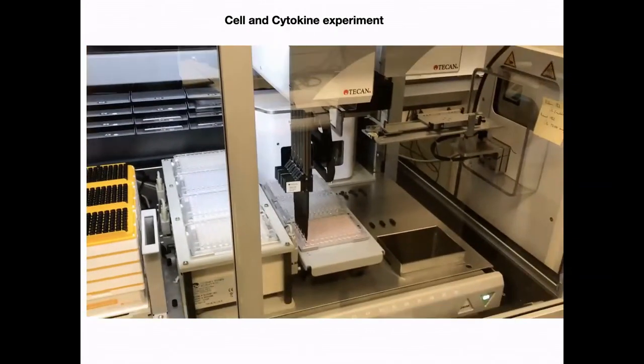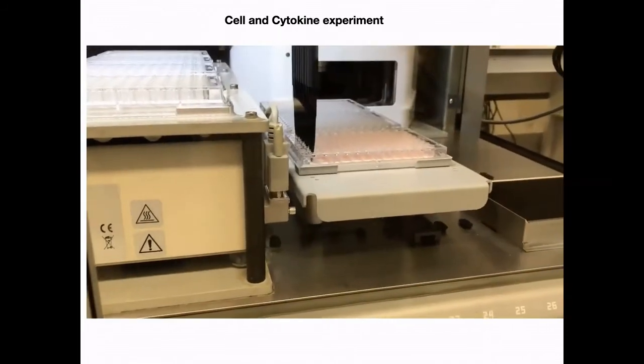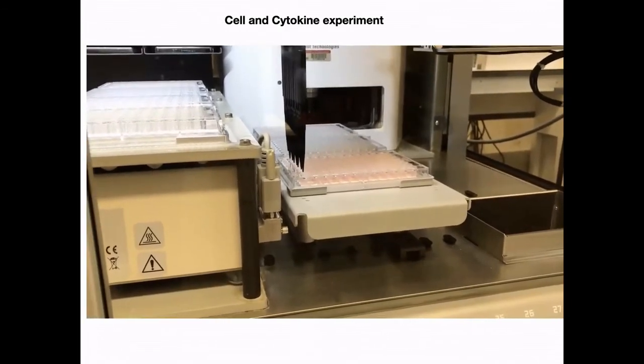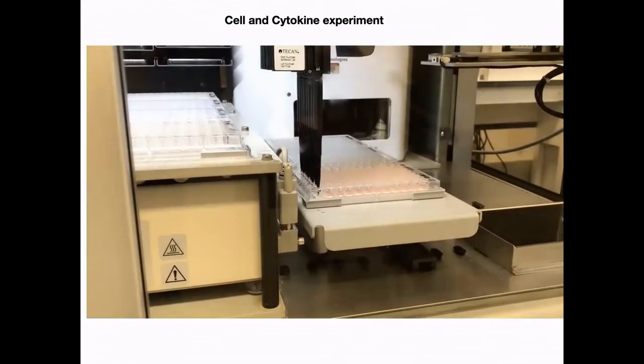And so you see, then you pipette, you just do everything you want here automatically. And of course, in each different well, you can do slightly different experiments. So you can automate and program everything. You see here, each little pipette is injecting what it needs to do, and then you do that also, and so on and so forth.